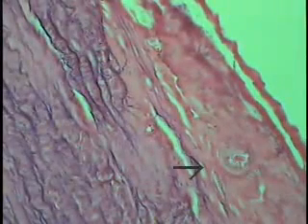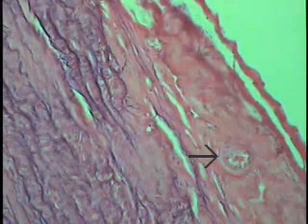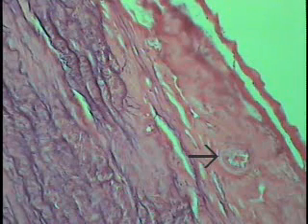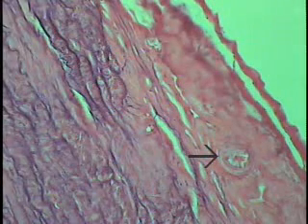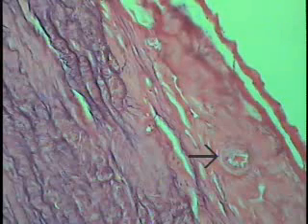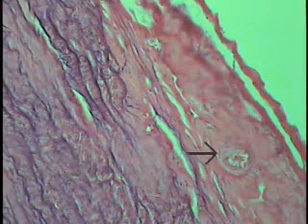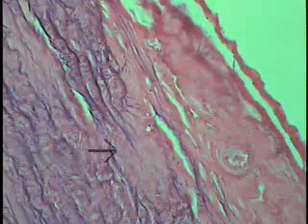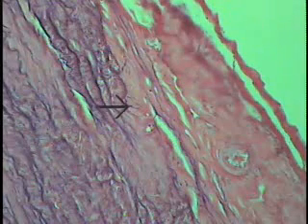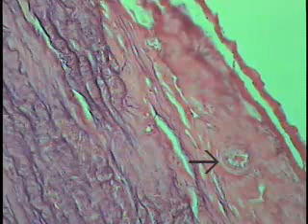A small artery at the tip of the pointer is an example of one of the vasa vasorum. These vessels, the conducting vessels such as the aorta, are so large that they need a vascular supply of their own, usually coming from neighboring vessels, to supply the wall and the musculature of this particular organ. So this would be a very small artery here. One can see an arteriole extending here, and then perhaps going down into supply a portion of the media. Vasa vasorum, you will find these vessels primarily in the adventitia surrounding these large elastic or conducting type arteries.